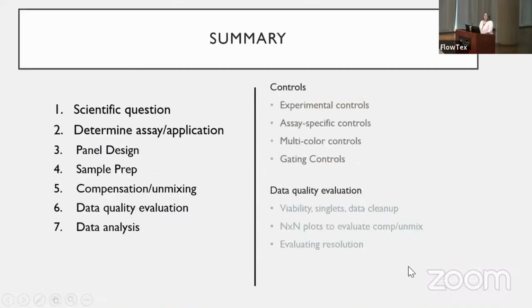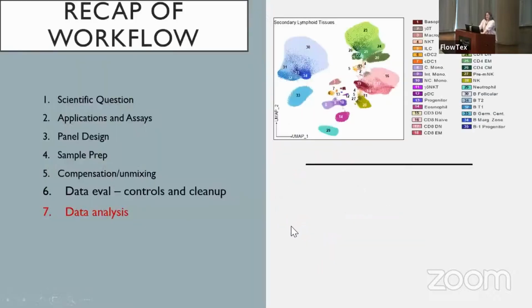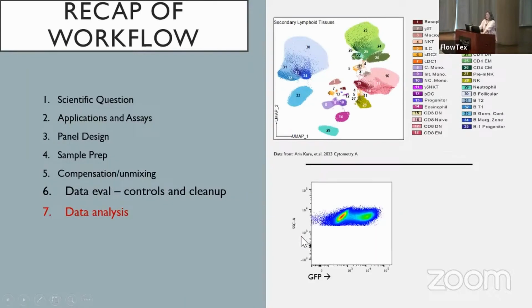All right, so that's pretty much everything. We have this workflow that we went through today, from our scientific question and looking at our assays all the way down to sample prep, panel design, compensation, and unmixing. And then we're going to do this final data quality evaluation so that you can all get this at the end of the day.